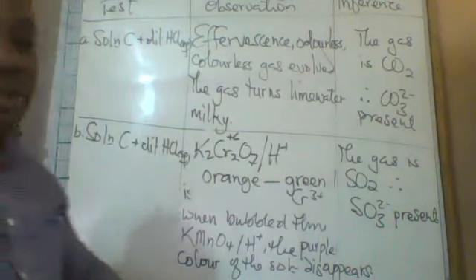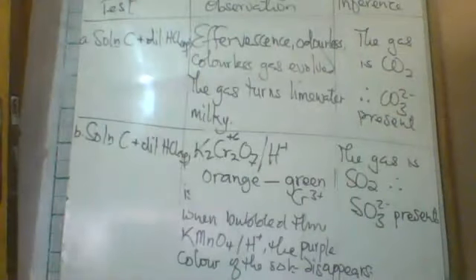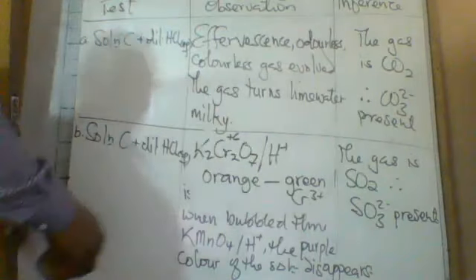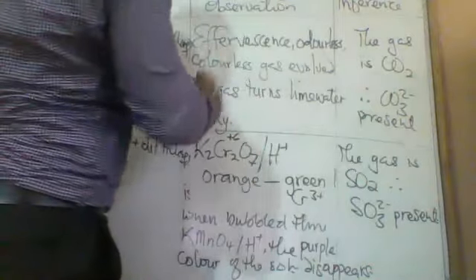Then we come to the SO4 2 minus. That one, he said, doesn't give off a gas. So we move rather to the S2 minus.